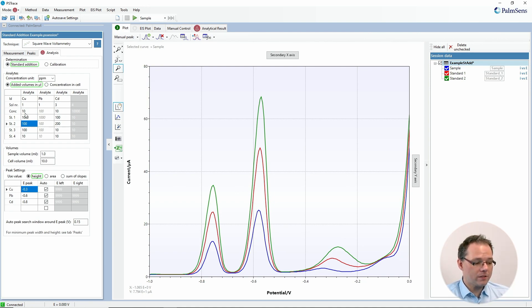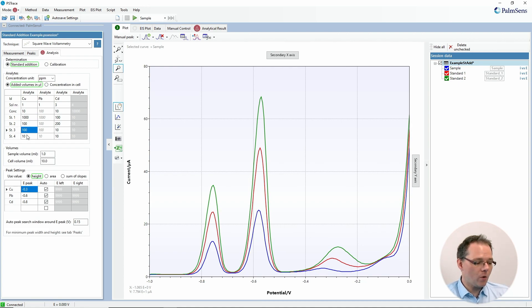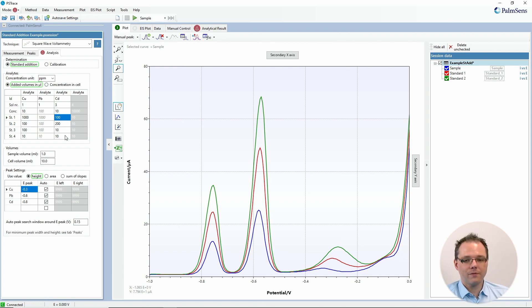Then you add the concentration again in the unit you've chosen for your standard solution, and then you determine for each of the steps how much volume you added of the corresponding solution. For example, for your first standard measurement you added one milliliter of the copper solution and one hundred microliters of the cadmium solution. That's how you fill in this table.